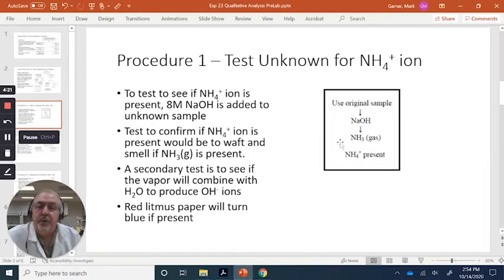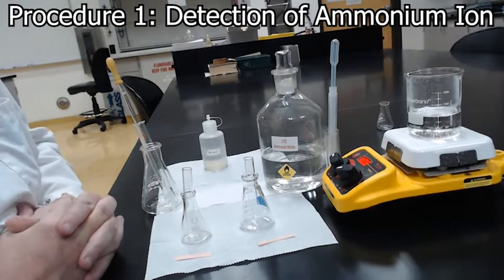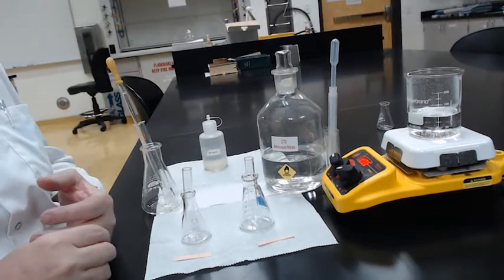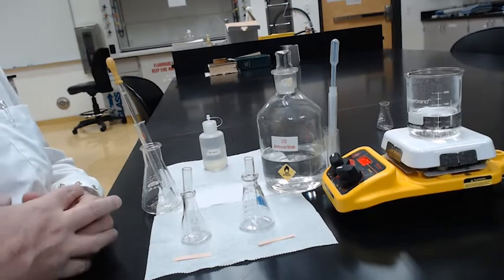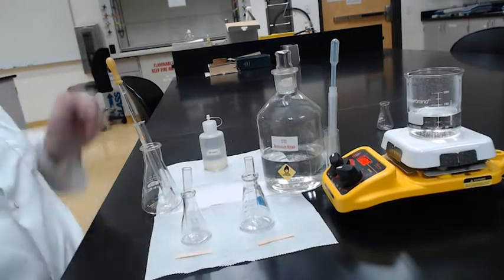So we're going to have a mixture of unknowns. It can contain some or all of the ions, so we have to figure out which ones are present. You're going to have to watch the lab demonstration video and confirm whether ammonium ion is present, which is the test for ammonium. We have to test for ammonium right up front because ammonium only really has one test, and it's the smell test or the red litmus paper test.